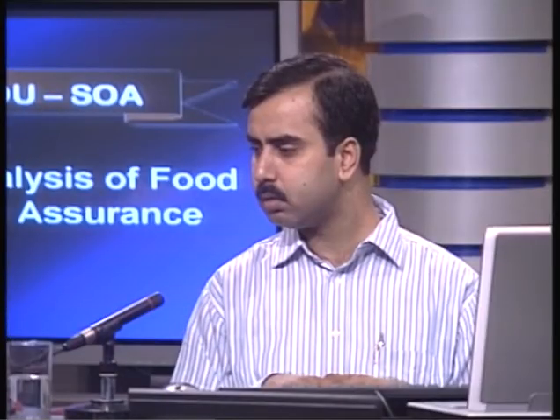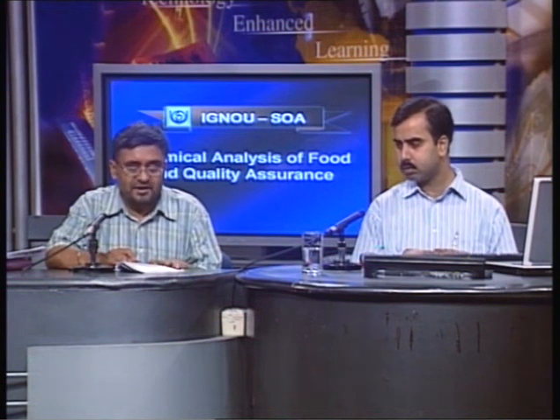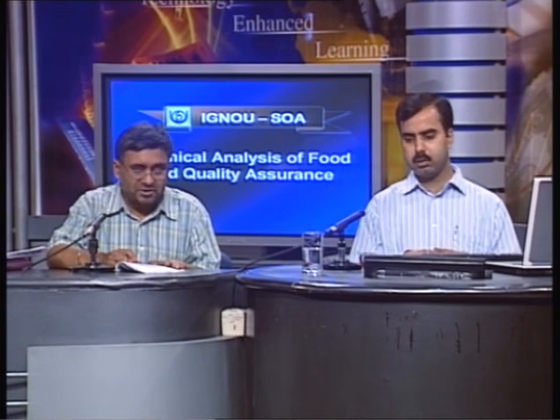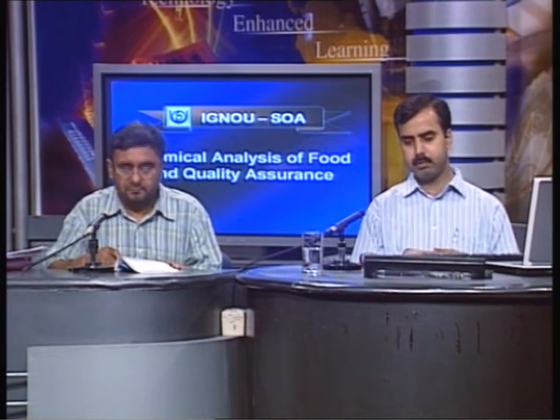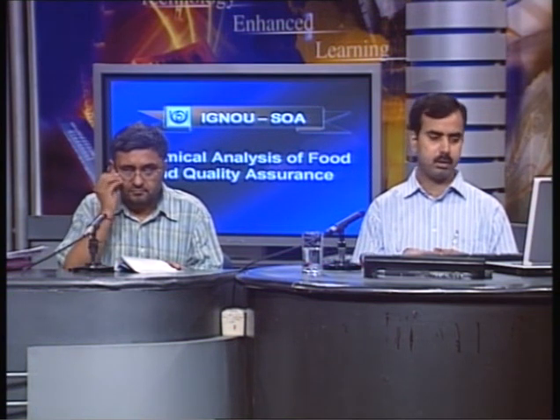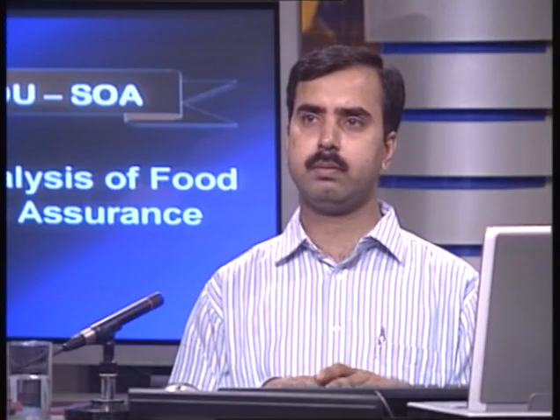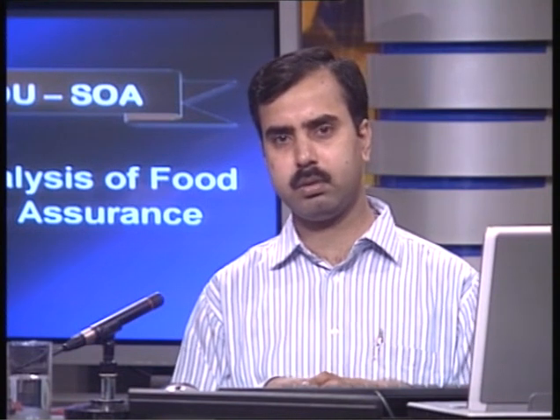Dr. Imran, may I request you, because some of the students are maybe fresh graduates, to tell something basic about HPLC, like special features or what precautions they should use in the operation of HPLC. HPLC is high performance liquid chromatography. Initially it was termed high pressure liquid chromatography. Later, because of its very good performance, it was retermed high performance liquid chromatography.